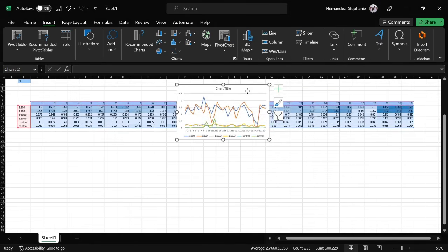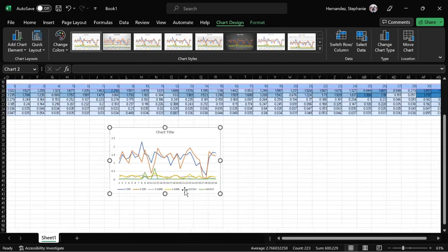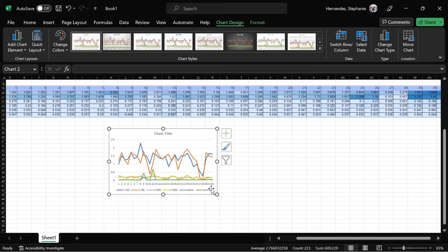And here we go. You're like, that does not look like what I expected it to look like. What went wrong? If we take a look at it, it's doing each individual seat number and then all of the data from that.